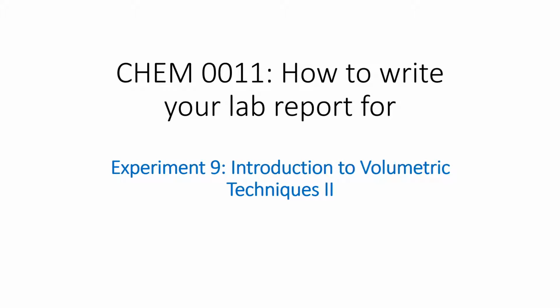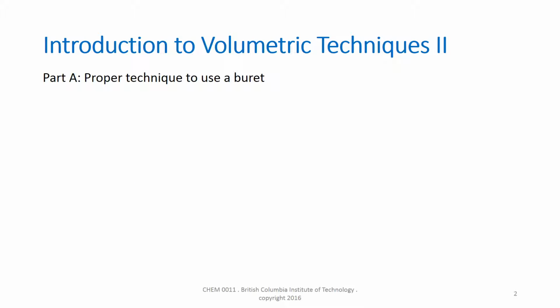Welcome to the video on how to write your lab report for Experiment 9, Introduction to Volumetric Techniques II. In Part A of this experiment, the proper techniques to use a buret will be learned.